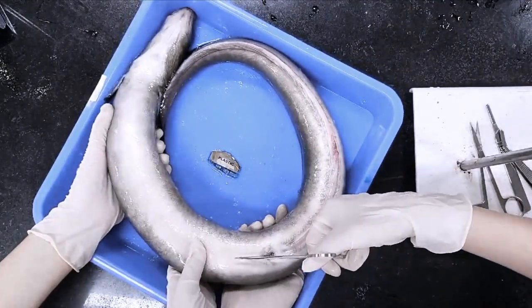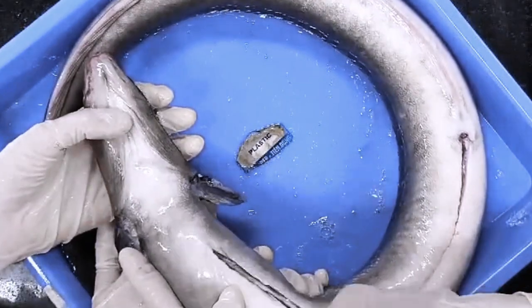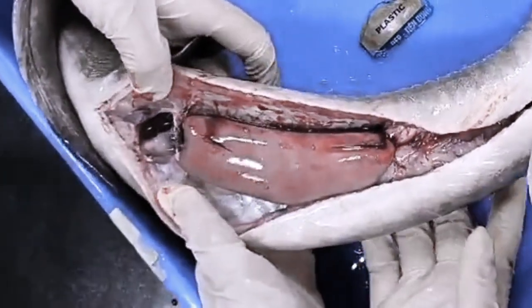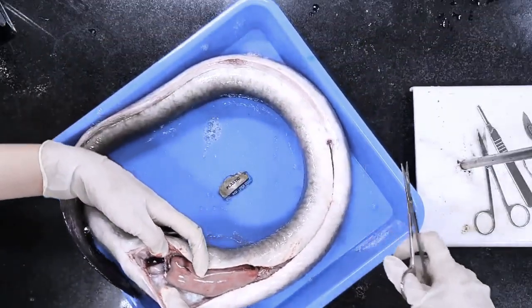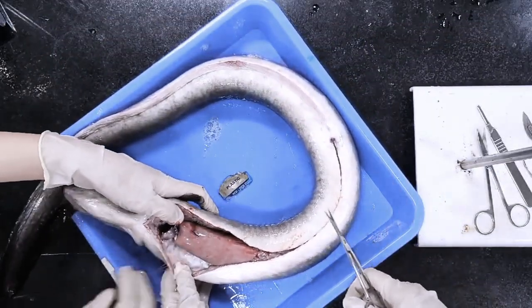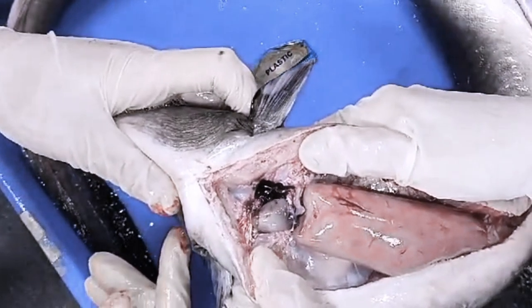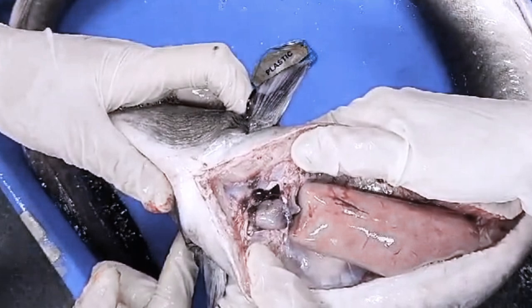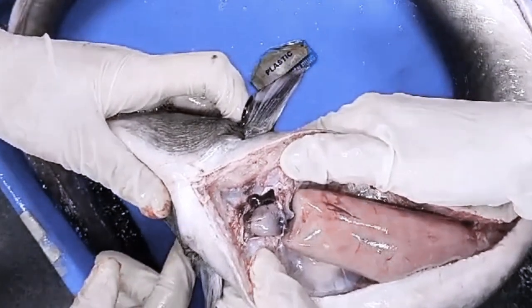Time to cut it open. The eel heart consists of four chambers placed in series: a sinus venosus, a thin-walled atrium, a more muscular ventricle, and an outflow tract.